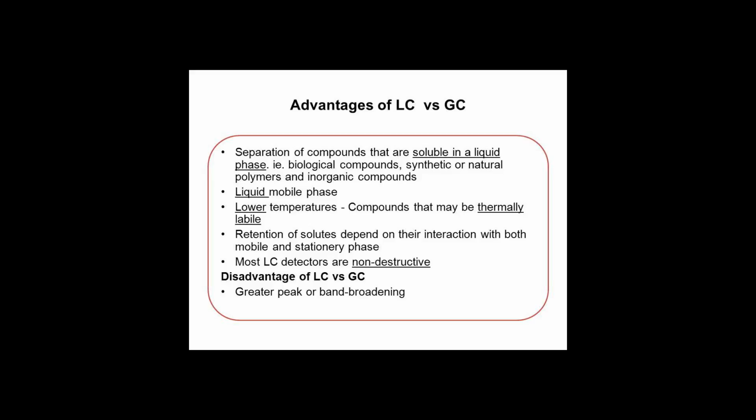Narrow bore columns, 1 to 2 mm, are used for applications when more sensitivity is desired, either with special UV-vis detectors, fluorescence detection, or with other detection methods like liquid chromatography-mass spectrometry. Capillary columns, under 0.3 mm, are used almost exclusively with alternative detection means such as mass spectrometry. They are usually made from fused silica capillaries, rather than the stainless steel tubing that larger columns employ.